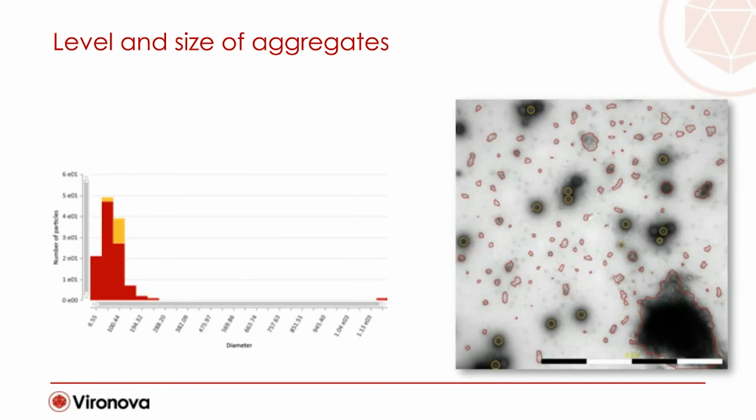The condensed statistical output can be used to quickly assess the sample composition. Deviating data can quickly be investigated using simple point and click on graphs, which will guide you through the right image for further evaluation. In this slide, we see, for instance, a deviating large registered object. Maybe, Josefina, you can elaborate a little bit about the possible causes and how this information can be interpreted.